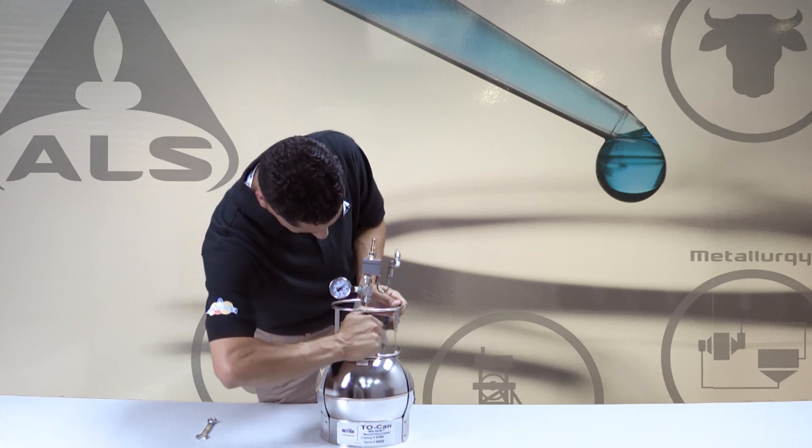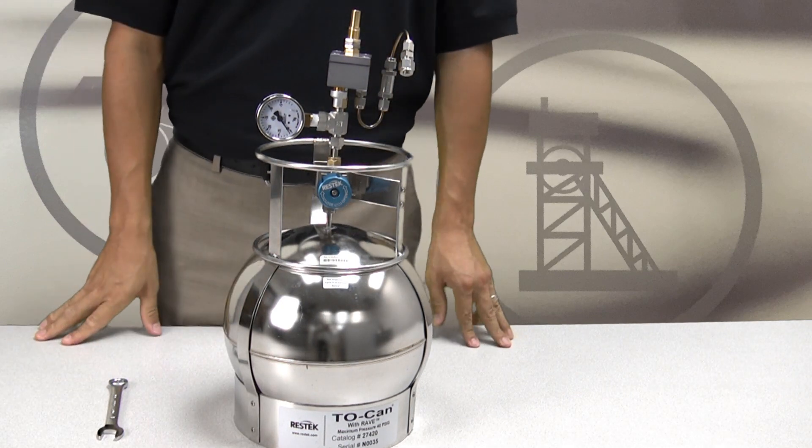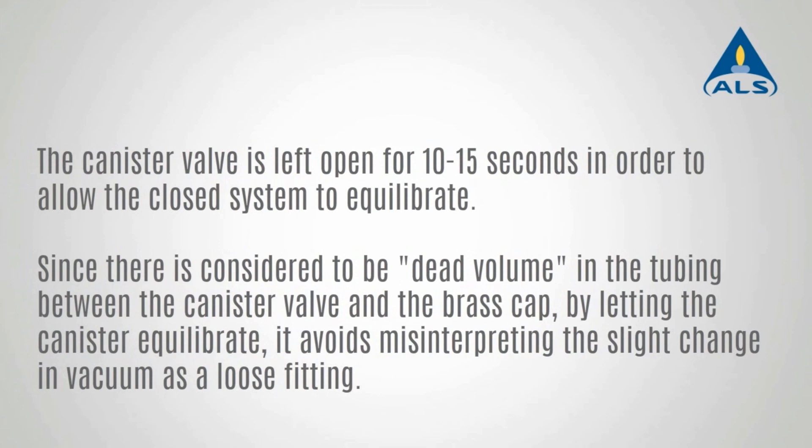Open the canister valve counterclockwise approximately one and one-quarter turns and leave it open for roughly 10 to 15 seconds. The open canister valve allows the system to equilibrate. By letting the canister equilibrate the dead volume in the tubing between the canister valve and the brass cap, it avoids misinterpreting slight changes in the vacuum as a loose fitting.